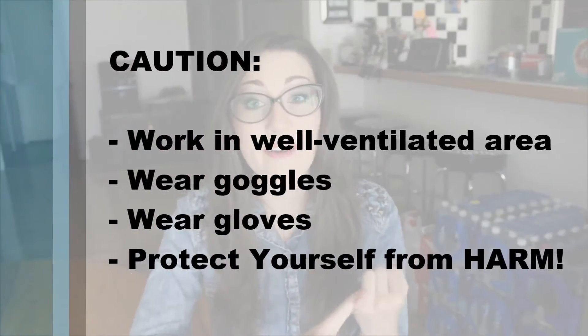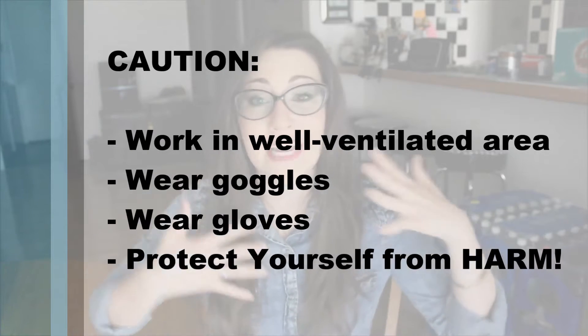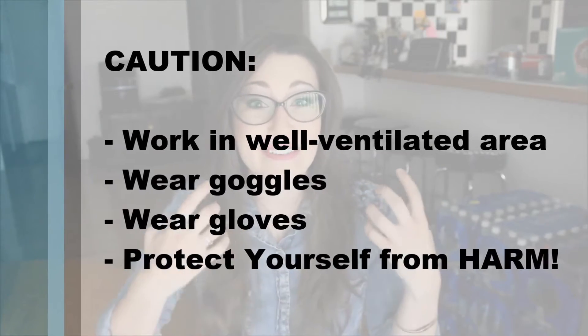I want to stress that since these chemicals are very hazardous and very corrosive, you want to work in a well-ventilated area. You also want to make sure you have your goggles on and your gloves, and any type of old clothes or things that you don't care about getting messy, because these are very, very dangerous chemicals. Alright, so now that we have all of our materials, let's get started.